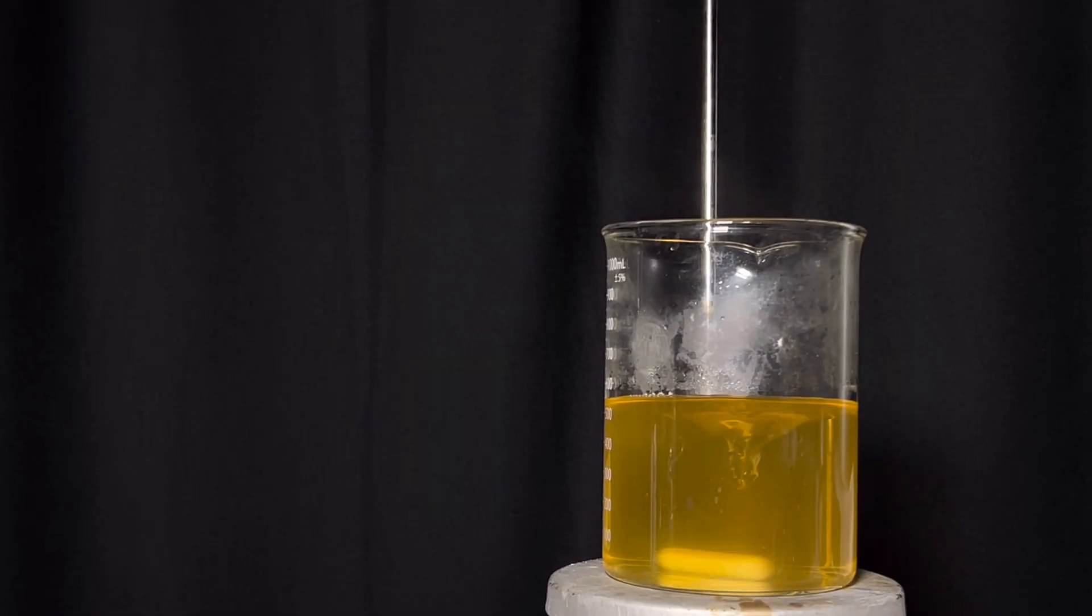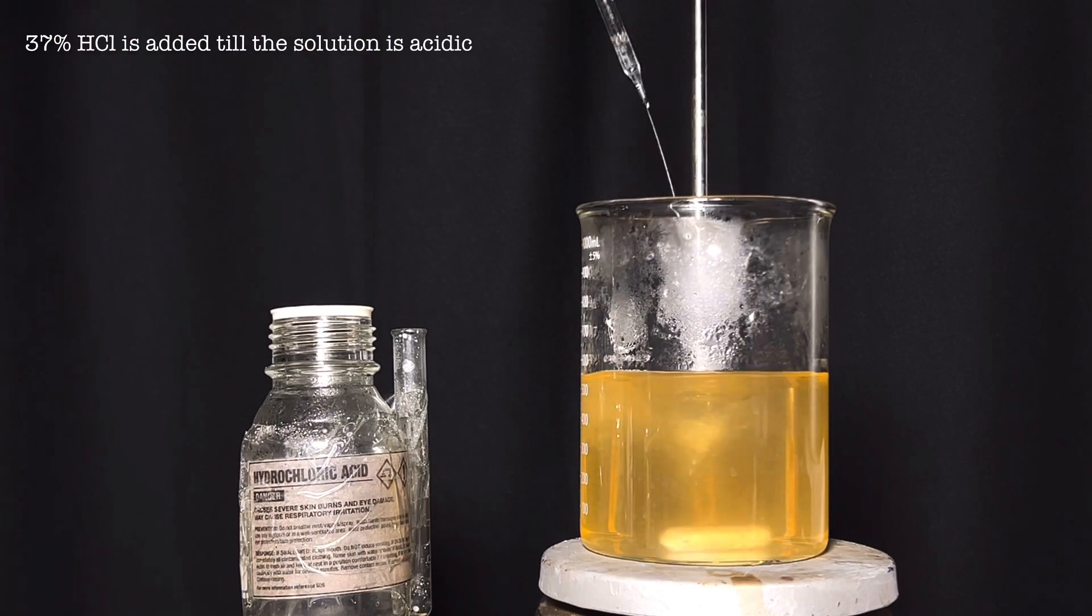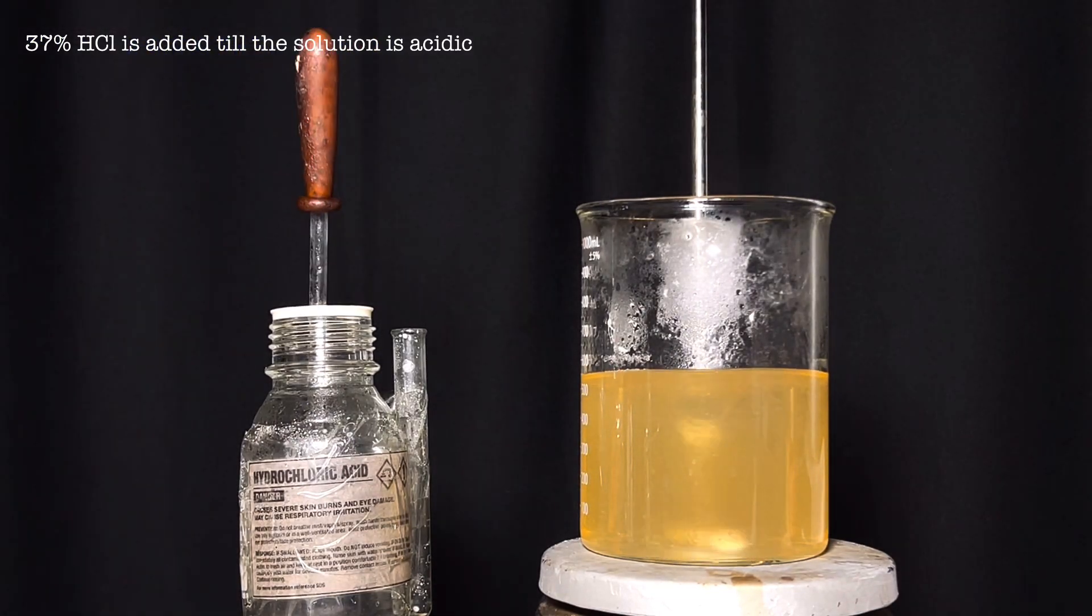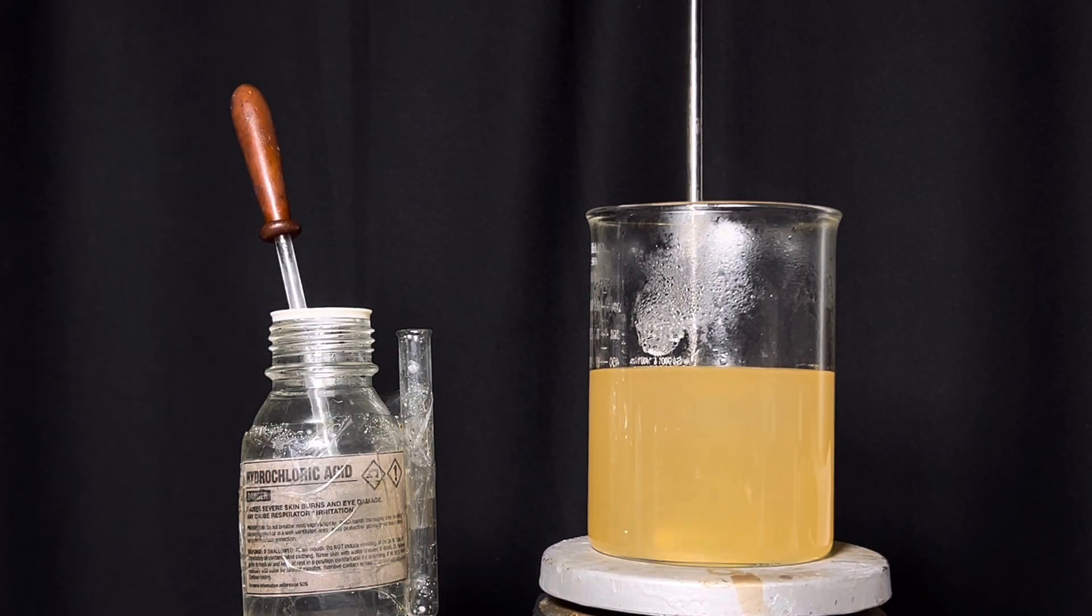The contents were poured into a larger 1000 ml beaker and stirring was turned on. Concentrated 37% hydrochloric acid was added drop-wise until the evolution of carbon dioxide stops completely. The solution also turns milky at the end.